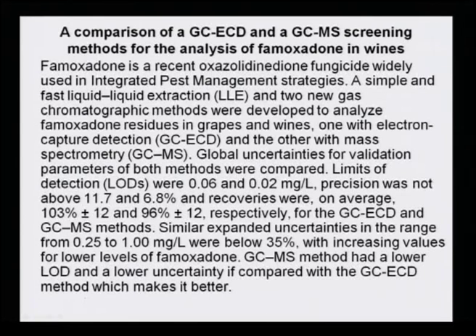Similarly, a comparison of GC-ECD and GC-MS screening methods for the analysis of famoxadone in wines has been carried out. Now, unless and until we use two methods simultaneously, we will not be able to say that GCMS is superior to GC-ECD.